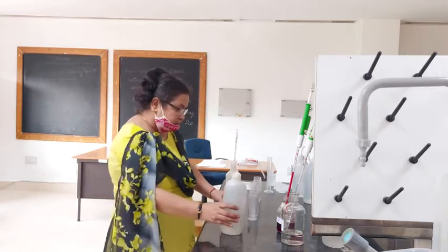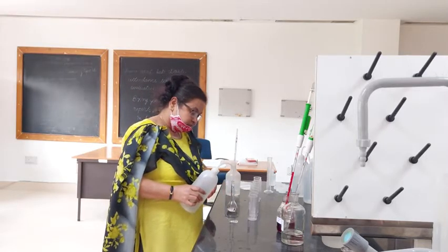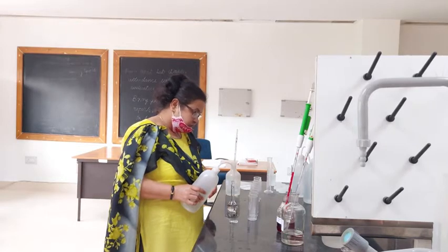Then the remaining amount is filled with distilled water. Then we mix it thoroughly and transfer it to one specimen tube which is numbered as 4.